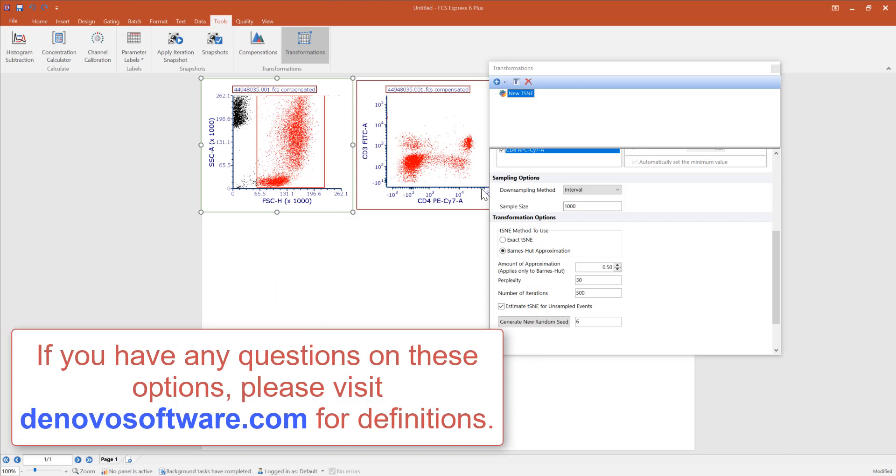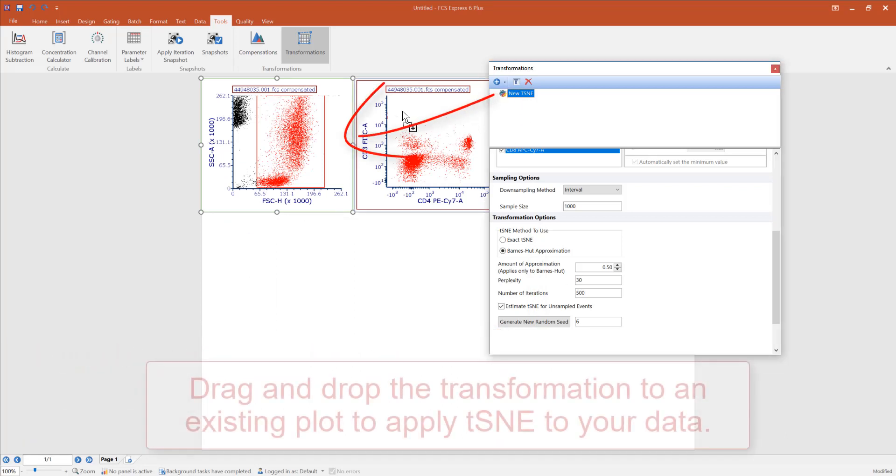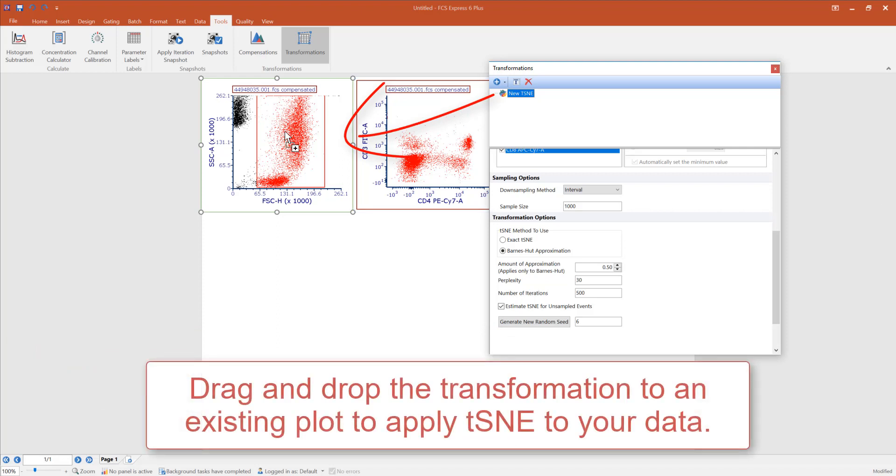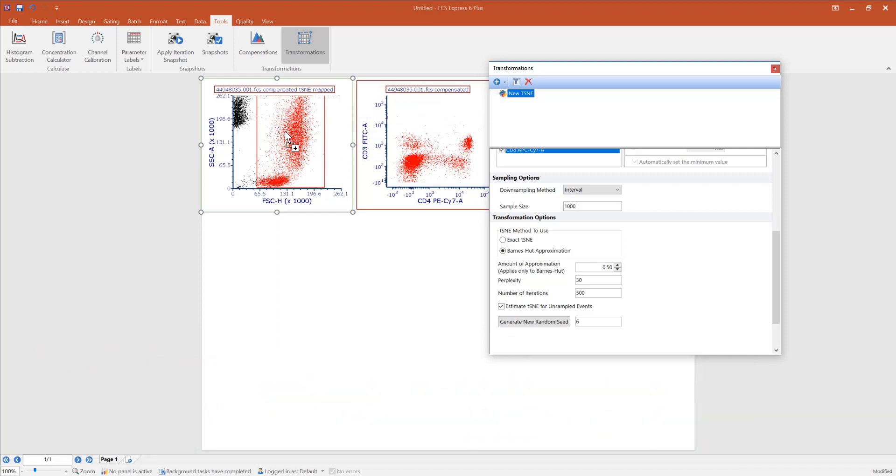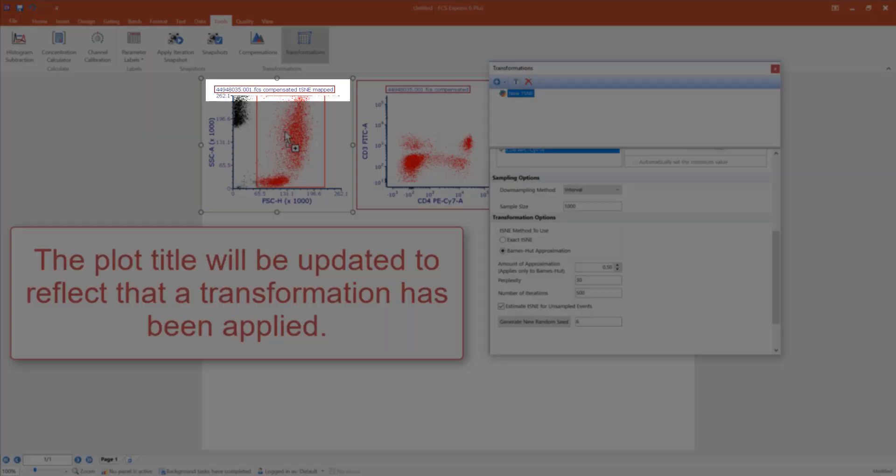Once the settings of your t-SNE have been selected, you may drag and drop a transformation onto an existing plot in the layout to apply a transformation. You can see the title has been updated to reflect that the transformation is applied.